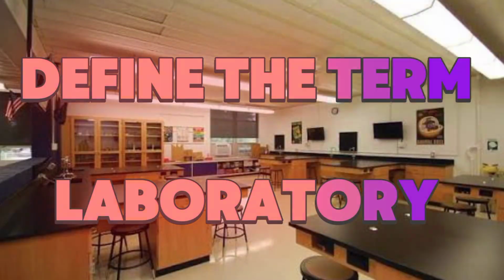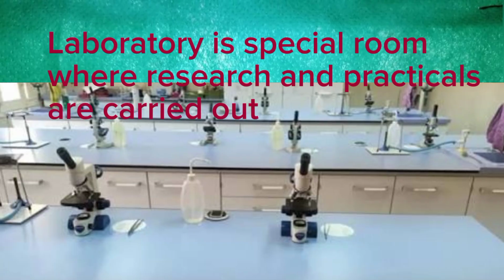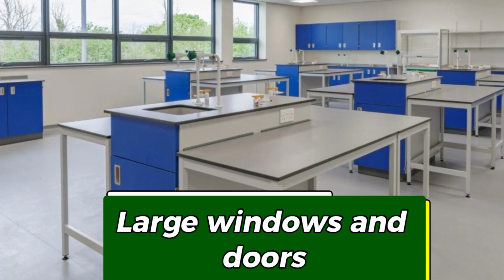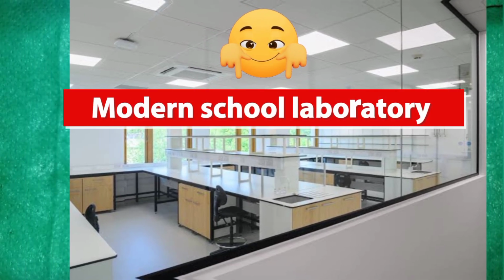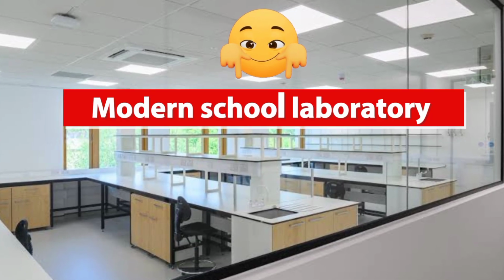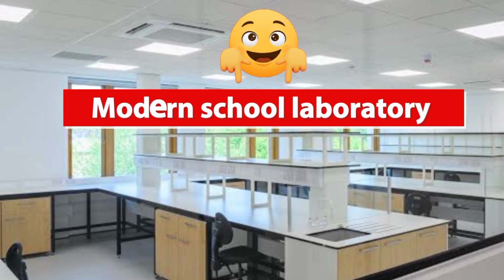First of all, what is a laboratory? A laboratory is a special room where research and practicals are carried out. Why does a standard laboratory have large windows and doors? They have large windows and doors to increase air circulation. It also has an emergency door to provide an alternative escape route in case of fire outbreak.